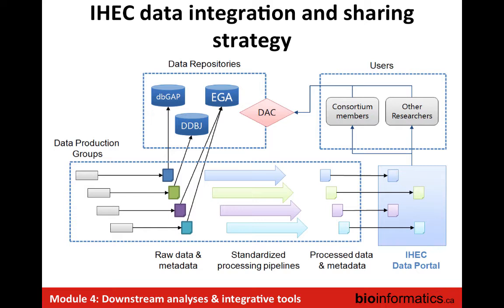But as a kind of shortcut, each of these groups has its own standardized processing pipelines. Right now, most IHEC members have their own pipelines, which differ in different ways. And we're gradually working on standardizing these to have results which are gradually getting more comparable. But this is to say that the processed data that gets output out of that is available in the open.